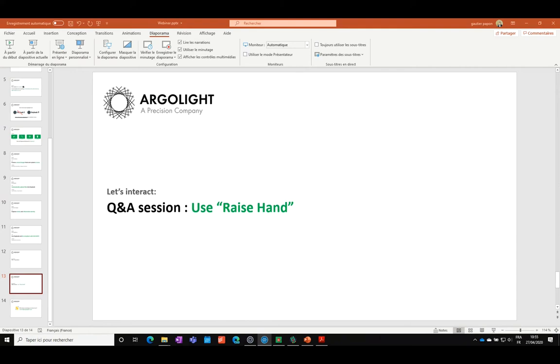We do that for two reasons. That is, when you increase the number of systems, you have to increase the naming conventions of your files. So your file's name must have the name of the system, the name of the profiles, and the name of the patterns. So it can be quite complicated. So for this first iteration of this batch process functionality, we just reduced it so that you have to have all the images coming from one system in your library. Maybe in the future we will change that, but for now, just upload the images coming from one system, process them, and then upload the images from another system, etc.